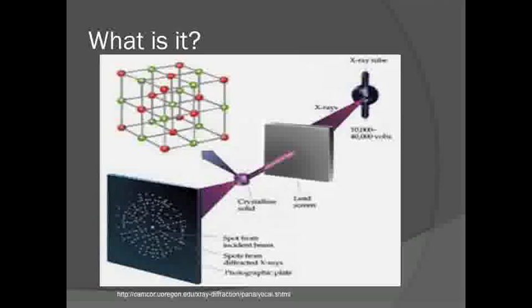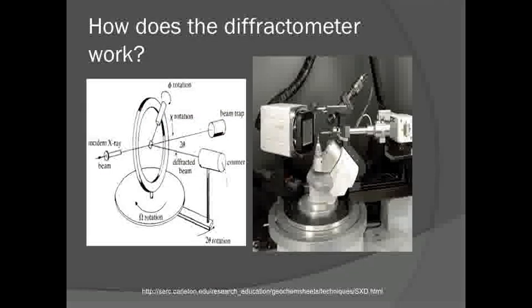The size of the spaces dictate the magnitude of diffraction, which in turn dictates the final position on the photographic plate. X-ray diffractometers can be partitioned into three main components: the X-ray tube, the sample holder, and the X-ray detector. The very first step of X-ray diffraction begins with the creation of X-rays. The first component of the X-ray diffractometer is the X-ray tube.